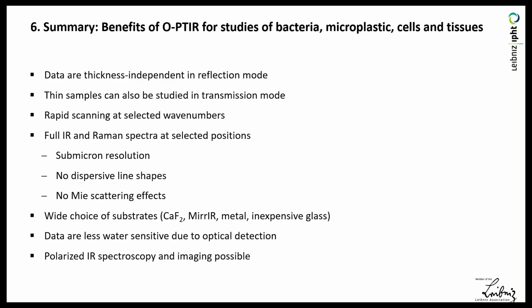I very much enjoyed your work with different cell lines, very systematic, really nice foundation for the future to come. I'm just wondering, how come you had 3 models being built in the classifications and testing that? You have measured 6 or 8 different cell lines, right? 6 cell lines, yeah. And you just built 3 models, 3 classifiers.